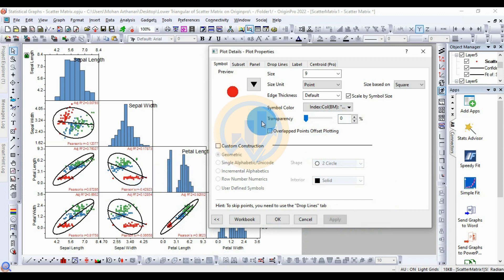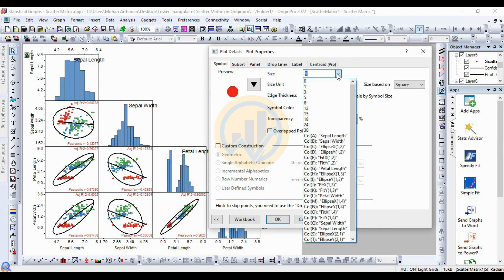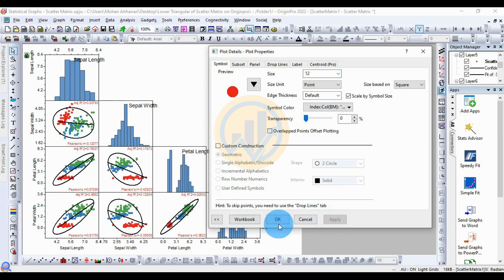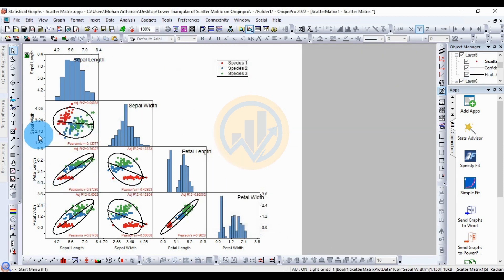To change the size of the oval shape, increase it to 12, then click Apply. The oval size updates accordingly. Click OK to confirm.